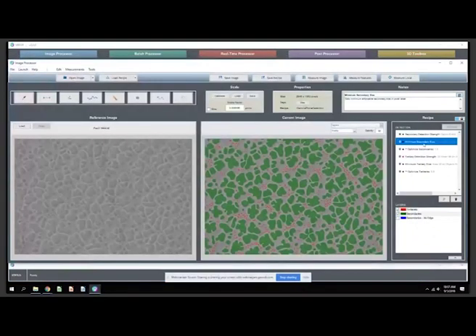Here we have a minimum size setting for what counts as a secondary that can change the difference between green and red. And what you would see is if you updated this, you would see the classification change before you in real time. So that is another element of how quickly you can adjust this algorithm and customize it for your needs. Make a change, hit accept, the rest of the algorithm rebuilds, and you see an updated classification.